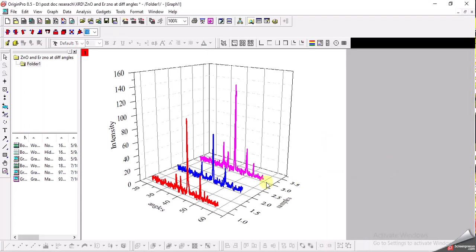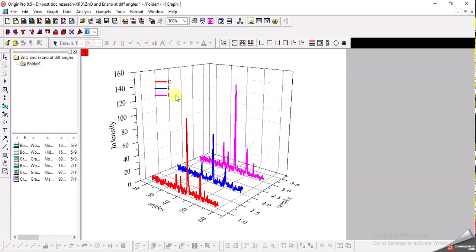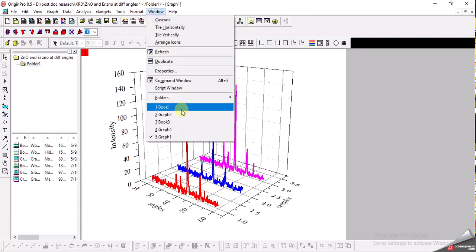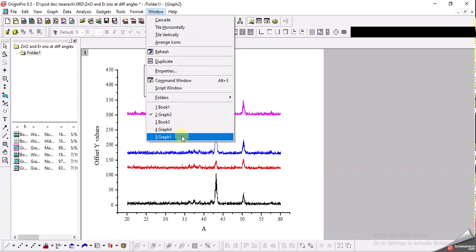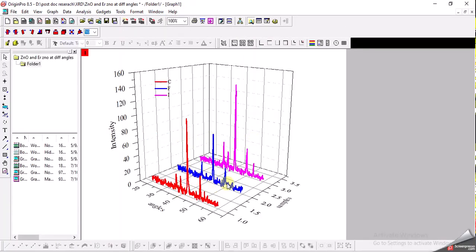If you want to label which sample is which, we can add a legend. Of course you can change the names C, F, and the other one to Sample 1, Sample 2, and Sample 3. Here is a very nice and beautiful 3D graph of the XRD - it is very clear and legible compared to the 2D graph. In the 2D graph there are small peaks which are not clear, but when transformed into a 3D graph the peaks are quite clear and comparison is much easier. I think I will choose to draw a 3D graph from now onwards for XRD as well. That's it for today.